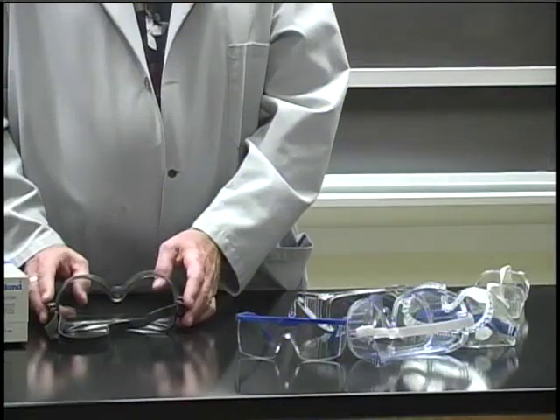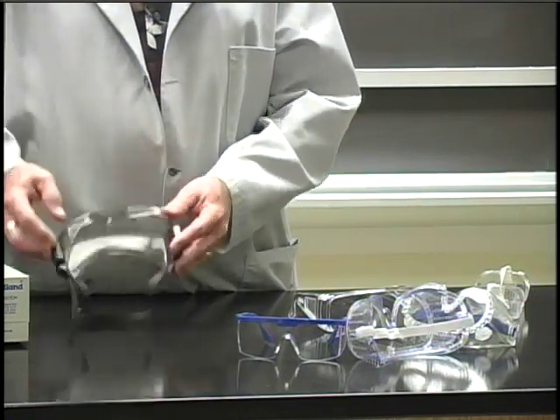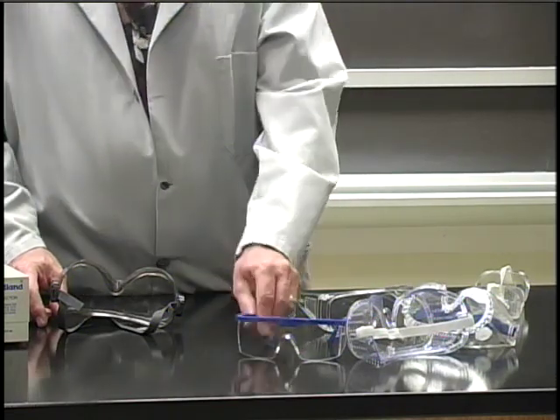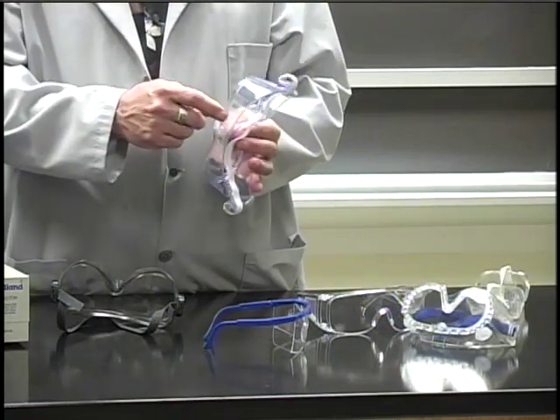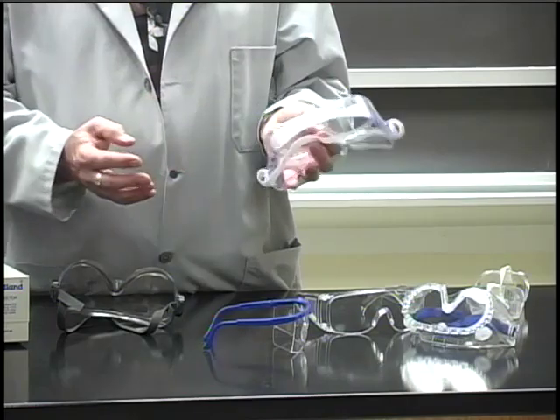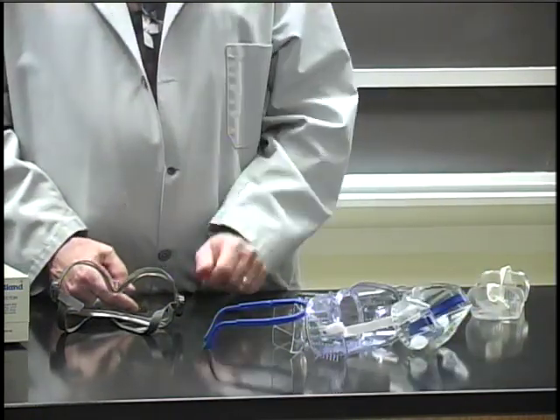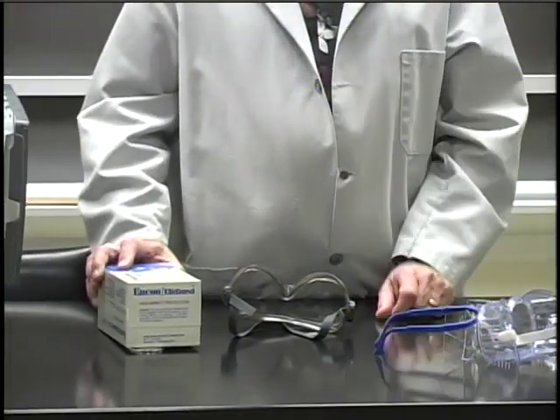The most important piece of personal protection equipment in the lab are the chemical splash goggles to protect your eyes. It's very important that you get the correct kind of goggles specifically made for chem lab. Proper safety goggles for chemistry lab will completely enclose your eyes so that no chemicals can splash into your eyes from any direction. There are lots of kinds of eye protection available, but many of them are not really suitable for chem labs. Things such as glasses that just have side shields, or goggles that have holes in them where liquid can splash through, are not adequate protection. Goggles that don't fit your face and leave a gap between your cheek and the goggle are also inadequate. The safest way to be sure that you have the correct kind of goggle is to buy them from the MATC bookstore.